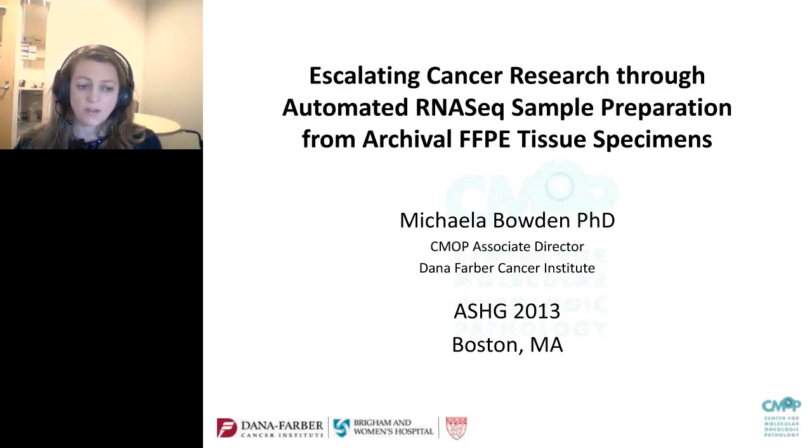I am the Associate Director at the Center for Molecular Oncologic Pathology, which resides within Dana-Farber. CMOP is a center which supports collaborative pathology-based research projects that have the potential to result in applications for targeted cancer therapy, with a particular focus on prostate cancer. Today I'm going to talk about automated RNA-Seq sample preparation for archival FFPE tissue specimens. And we're going to talk about prostate cancer tissue specimens.